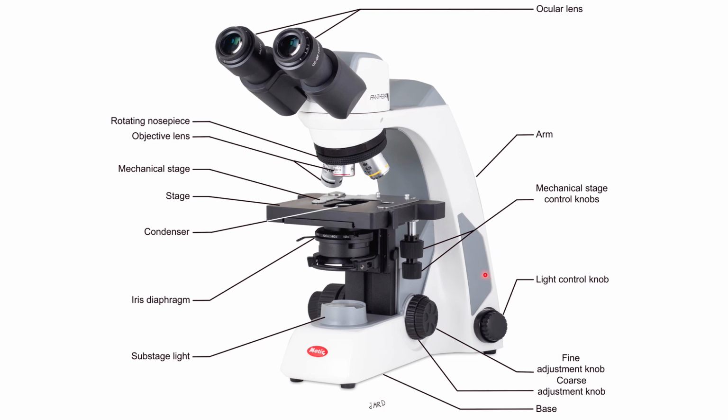I did forget one thing. When we are looking through the microscope, we have to focus. And there are 2 focus knobs. We have our coarse focus, which is the big knob, and the fine focus, which is the smaller knob. Coarse focus is going to make the stage and objective lenses come together faster, so you focus faster.